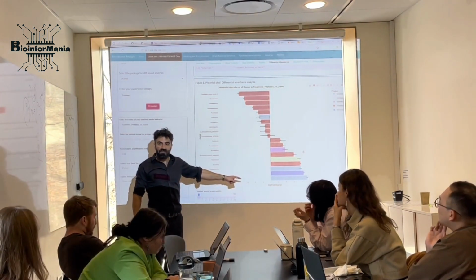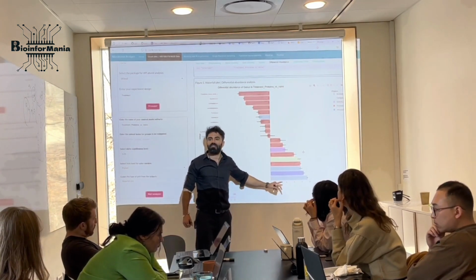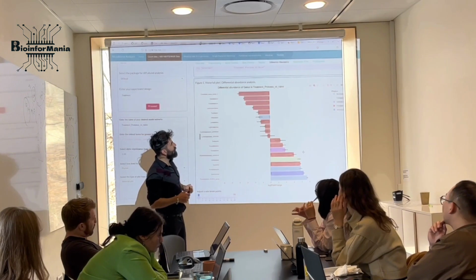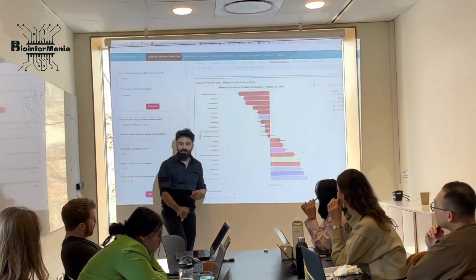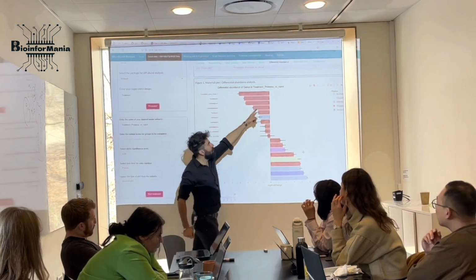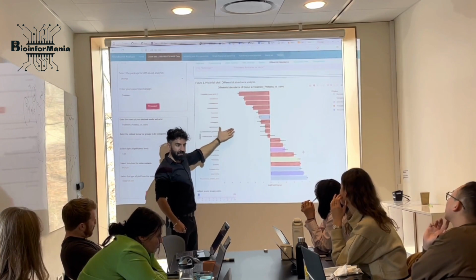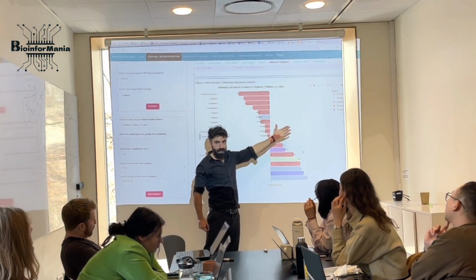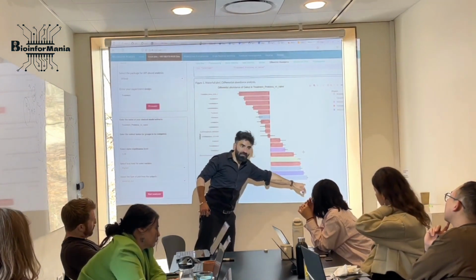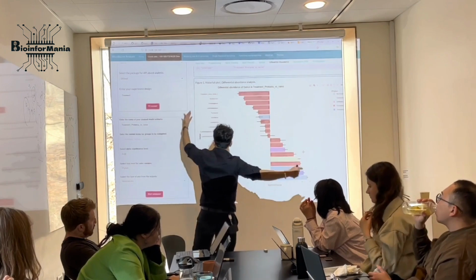When we are presenting these results, we don't say we have increased protozoa, we say we have higher protozoa. It doesn't mean it has been increased. We are comparing them. So, in this case, our numerator here is protozoa's count. The denominator is naive's count. So if it is negative, it means protozoa has less of that certain taxon compared to naive. And if it's more, protozoa has intuitively more of that, okay? This is fold change. We log it so that we have a clear demonstration. And then here is the name.